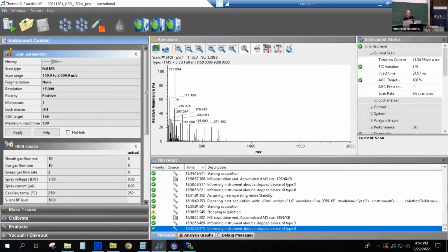And then, as a very first thing, I want to see that something is moving in there, so I actually see scans, right? If I don't see anything here, it's weird. Because it's so sensitive, it always detects some ions, right? So that's a sanity check.